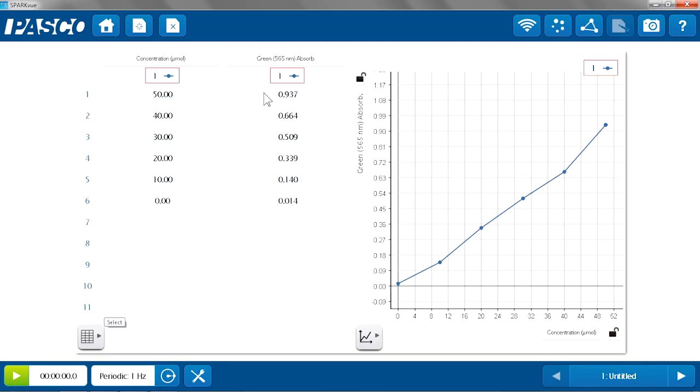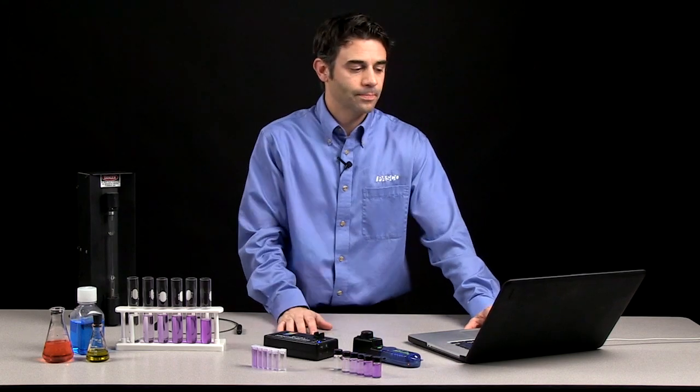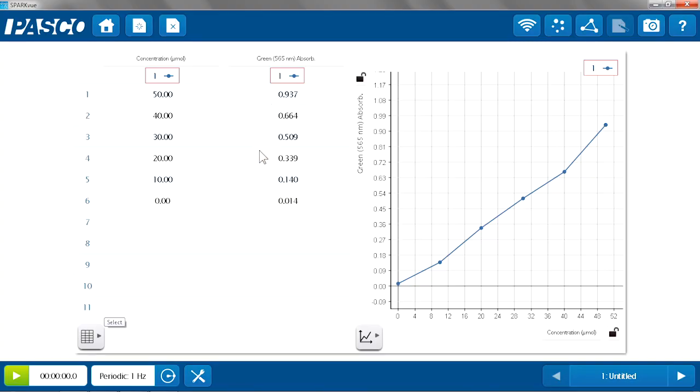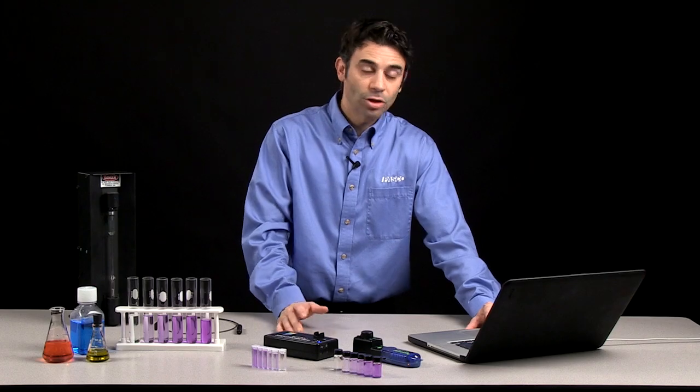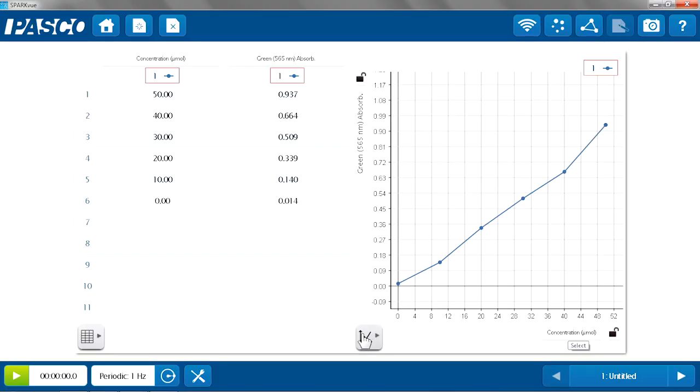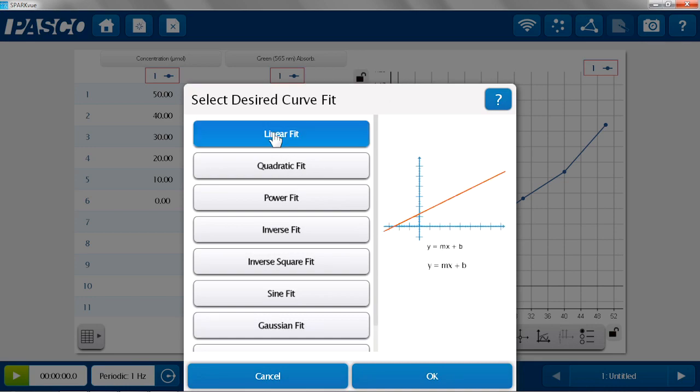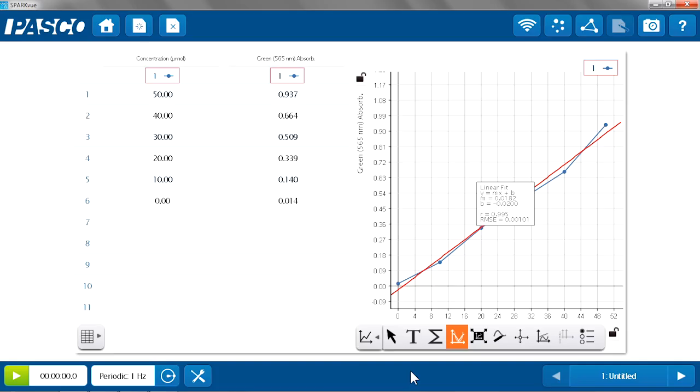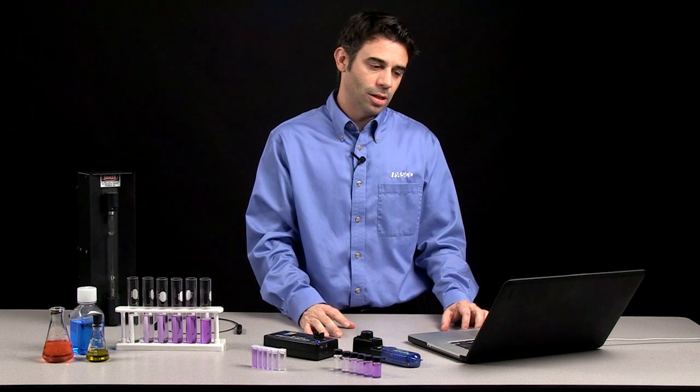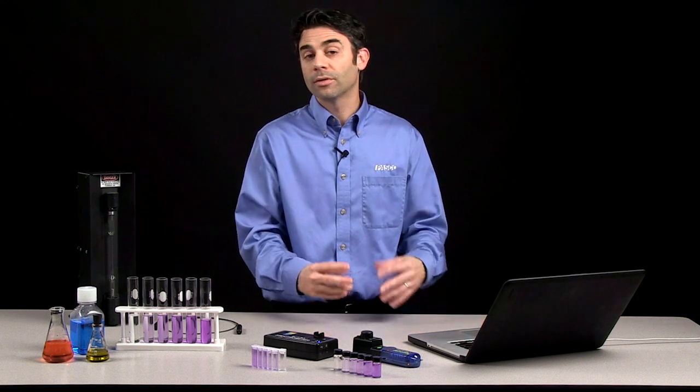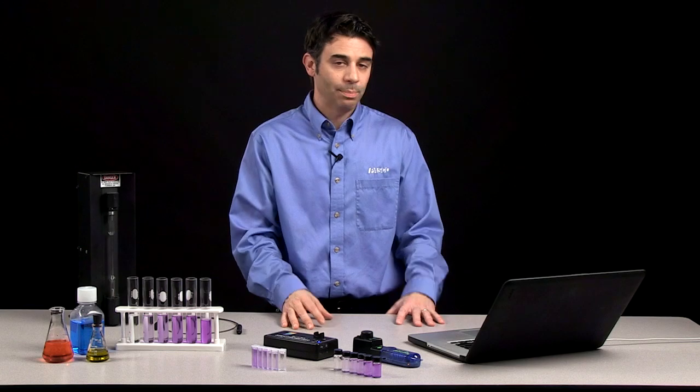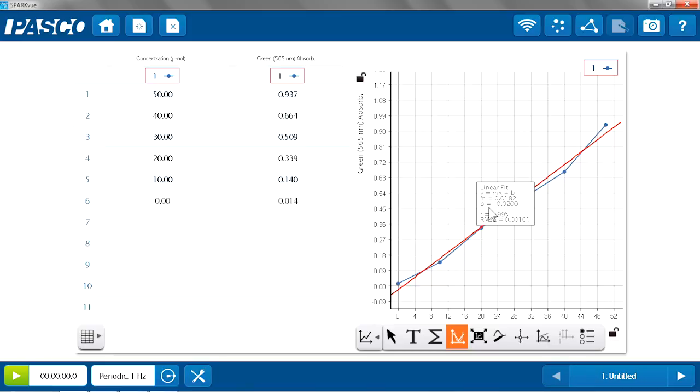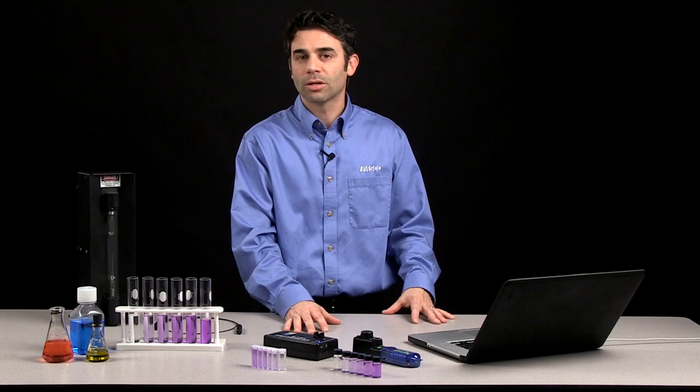And I keep the values, my absorbance values for each of those known standards. And as I keep those in the table, the graph will automatically populate, and I can see this relationship between absorbance and concentration. To further quantify that relationship, I can use my graph tools like my linear fit. And I can apply that fit to the data. And then the students can measure the absorbance of an unknown sample of crystal violet. And based on the graph and their fit, they can determine the concentration of that unknown.